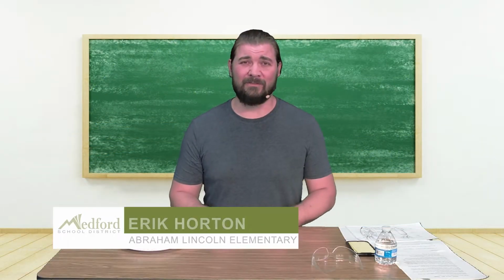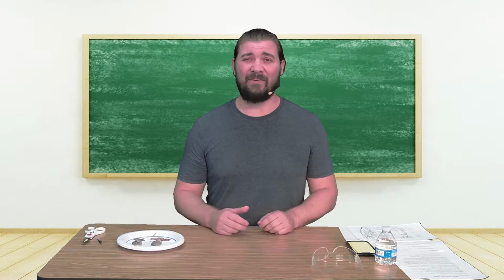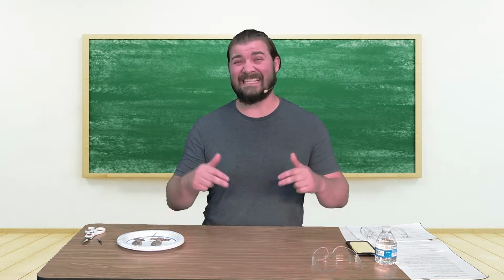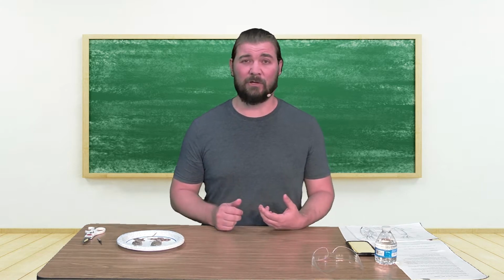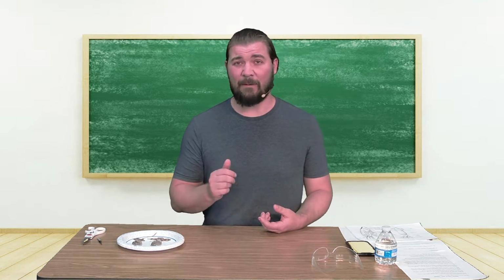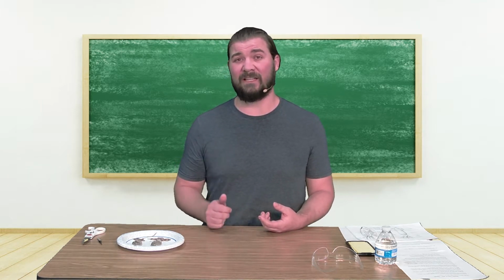Hi, I'm Erik Horton, 6th grade teacher at Abraham Lincoln Elementary, and today we're going to dive into biology and look at an organism called a squid. Not only are we going to look at it, but we're going to look inside the squid. So we're going to be dissecting this squid that I locally picked up at a grocery store called Food for Less. You have an opportunity to go down to Food for Less if you want and pick out a squid for your own dissection that you could do alongside of this video.